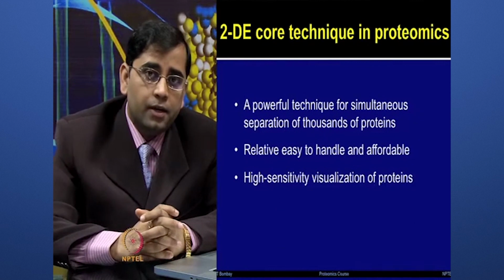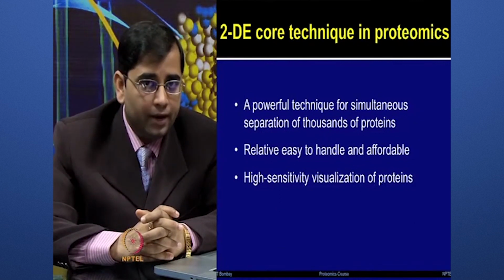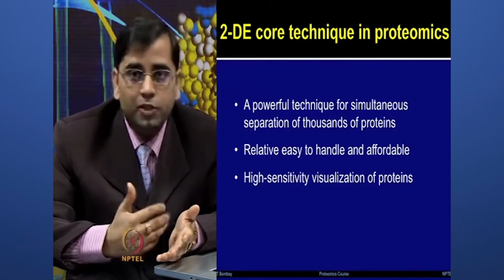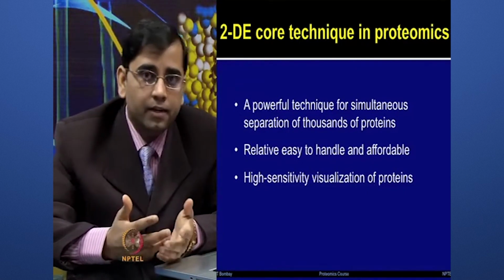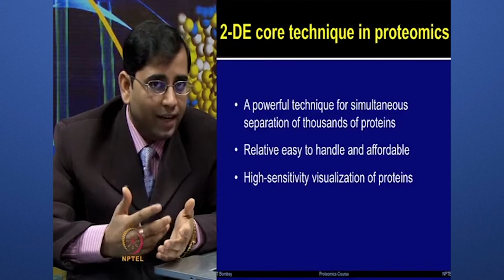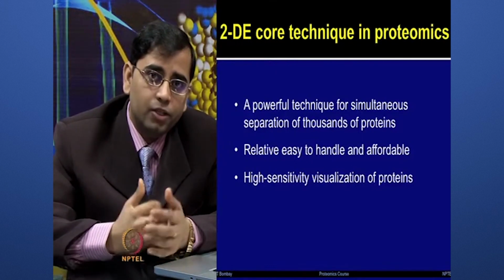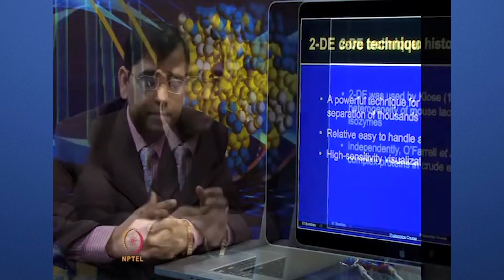It is a relatively easy technique to handle. It is not so costly, it is still very much affordable, so different laboratories use it widely. It is a highly sensitive method to visualize the proteins.